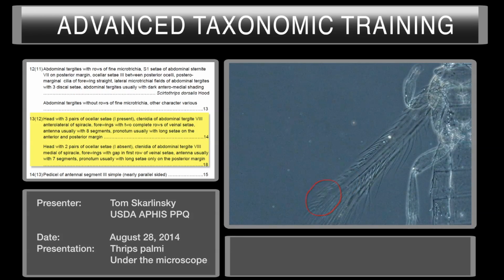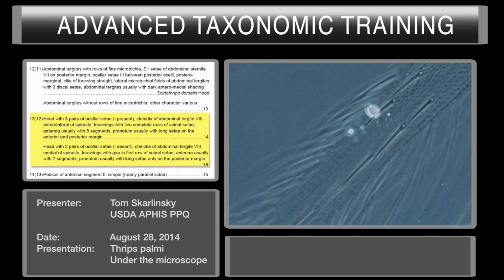So they're incomplete. We can always double check this too, and go ahead and increase the magnification. The reason that I'll do it is I just want to really confirm that this isn't just some of the setae being knocked off during preparation. We can clearly see that there's a seta there, there's a seta there.